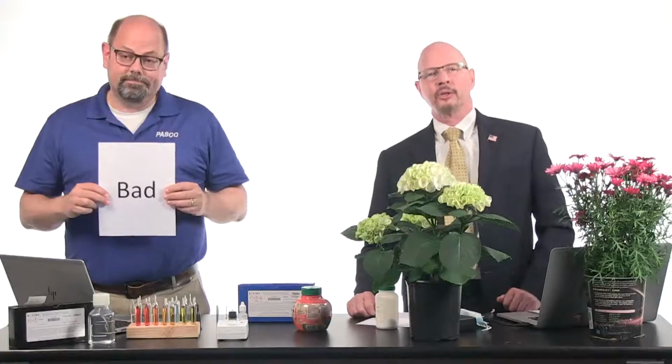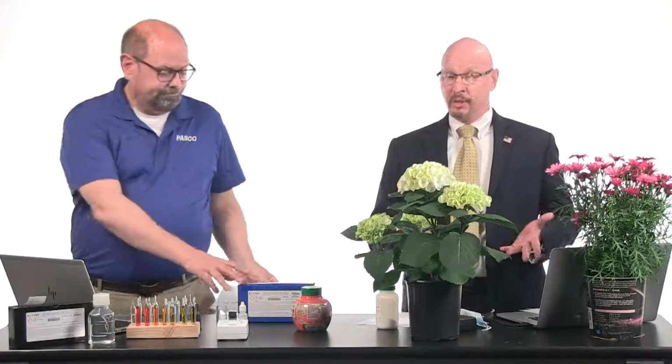That is not good. So we talk about nitrates as being good, and we can talk about nitrates as being bad. We recognize that they both have an implication. And one of the great things that we're going to show you now is that you can actually go out into the field, out into a stream like Roger did here, and measure the concentration of nitrates available in the soil. You can do it so quick and easy, using some maps and GPS, that you can then take a look at global issues when it comes to nitrates, and that's what Roger's going to show us now, right?